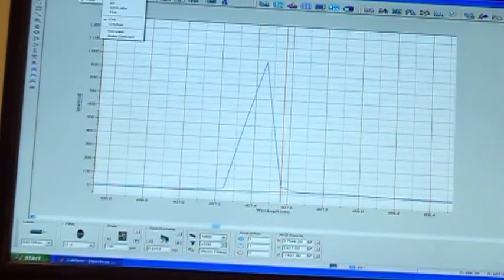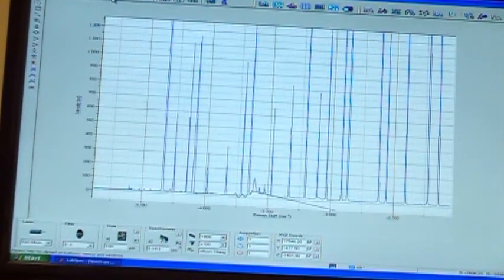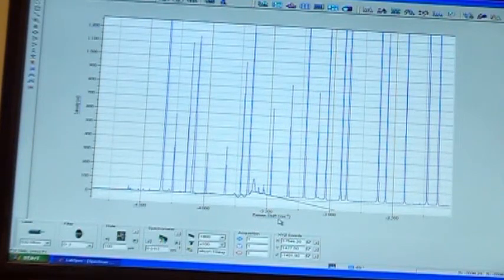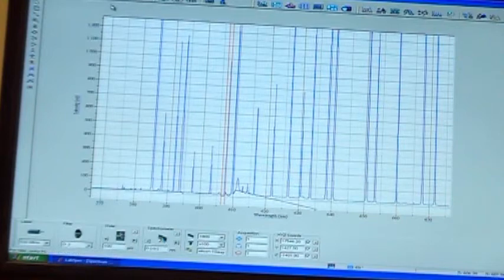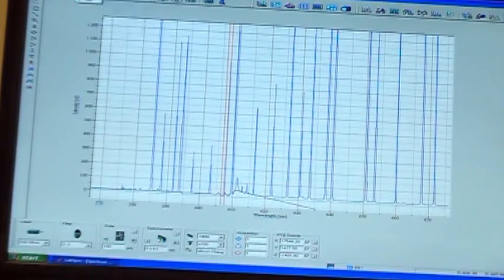If we go back, open options, unit, put back on auto convert. Now if I go options, unit, and change to wave numbers, my spectrometer once again went to wave numbers, and my nanometer data has now changed into Raman shift in wave numbers also. So that's options unit. That's where you would change scales and auto convert.